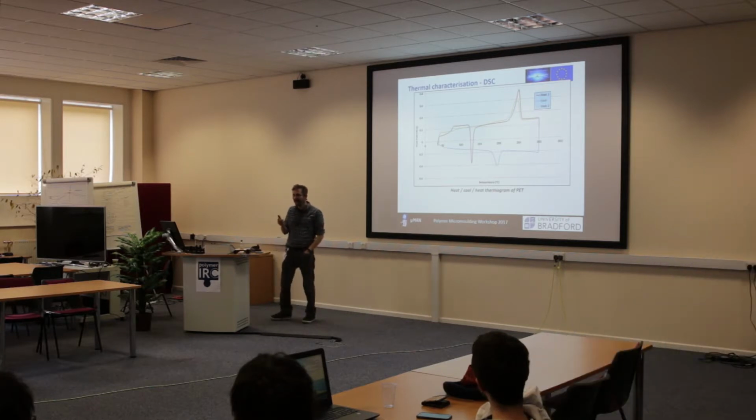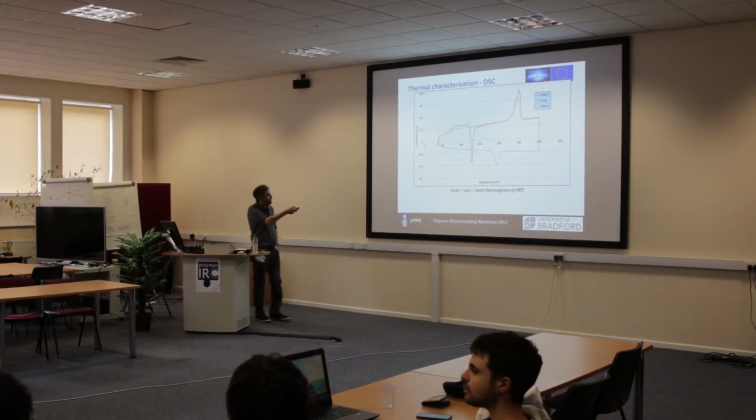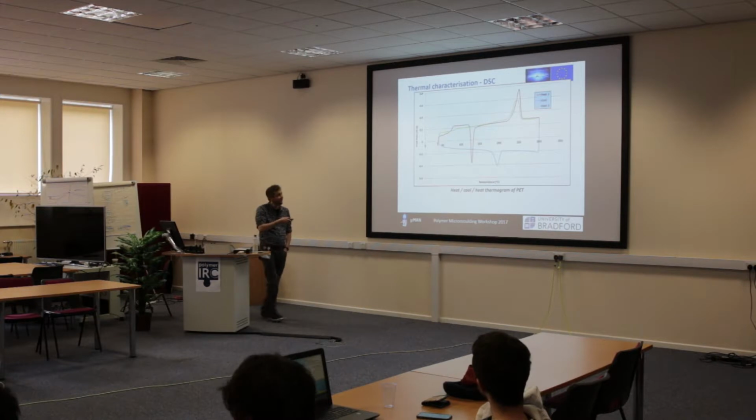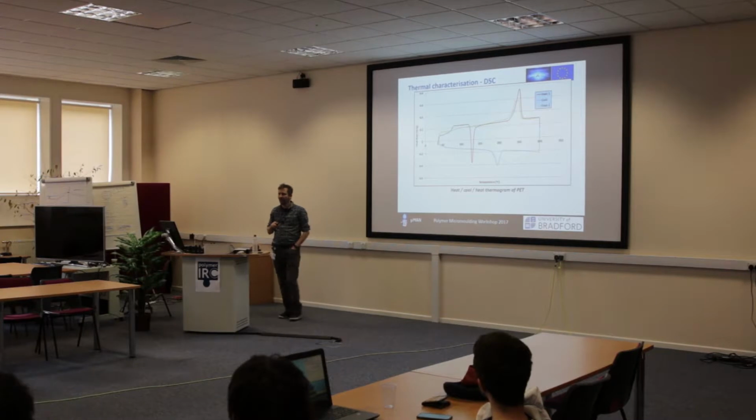Yes, let's, okay? So this is polyethylene terephthalate. When we heat the material, okay, so the red is the heat, we get this glass transition at roughly 55 degrees or so. And we heat the material up until we get to about 120. And then all of a sudden we've got this exotherm.